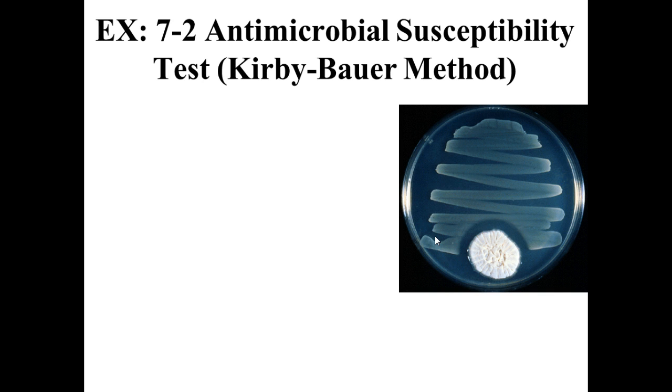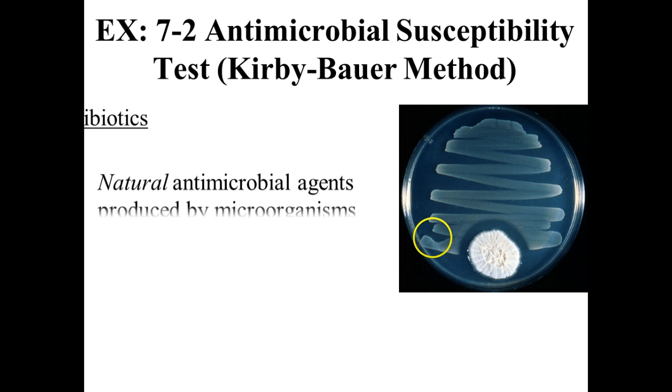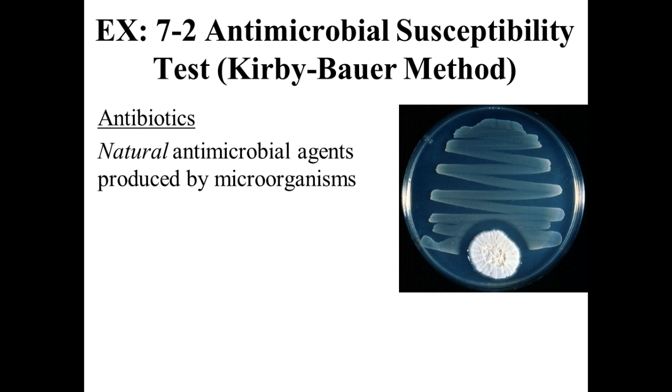Well, instead of putting the organism onto our plates today, we actually put discs that have a set concentration and amount of a certain antibiotic. By the labeling you saw, different ones had P and S. Those were to denote the different antibiotics that we're using. It's a coded system.